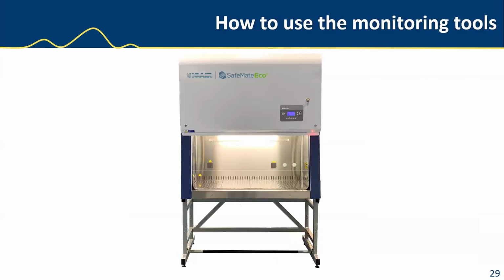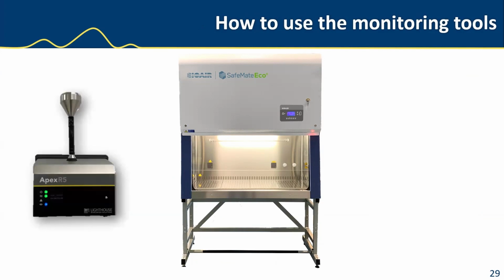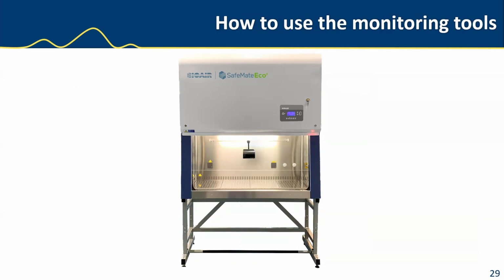In terms of using the monitoring tools, if we take a biological safety cabinet, for example, we implement the particle counter here. We have a remote particle counter. I like using these because they have a small footprint and they can be put inside the cabinet. That also eliminates the risk of particle losses in the sampling tubing.